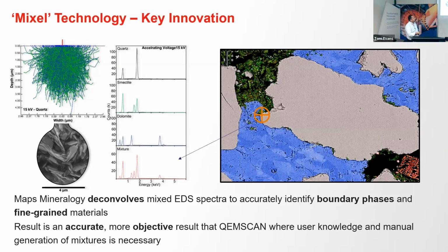that we have present in the sample. So what the software will do is classify in two steps. It will first identify the minerals that are occurring in our sample. For example, in here we have quartz. In here we actually have ferroan dolomite. So it's able to understand that we have dolomite-ankerite intermediate composition and classify it as a single mineral, like ferroan dolomite. And we have some clays. And then the software is able to deconvolute this spectrum into the individual components.